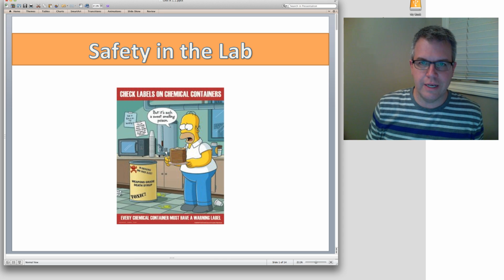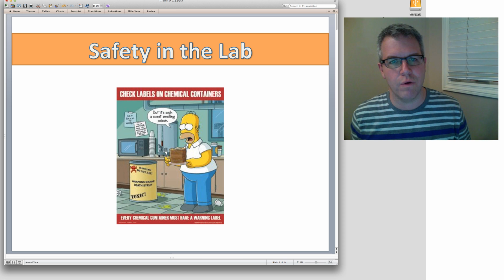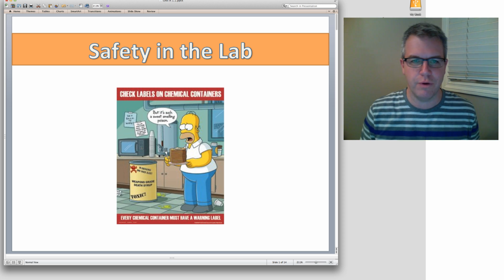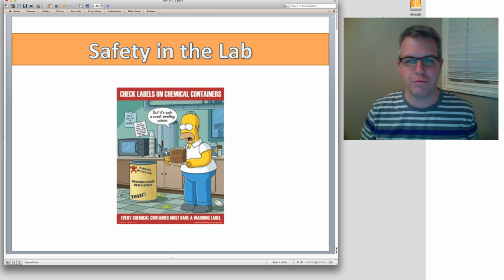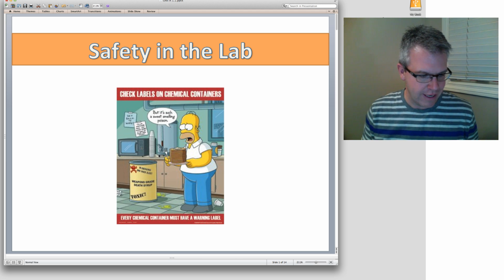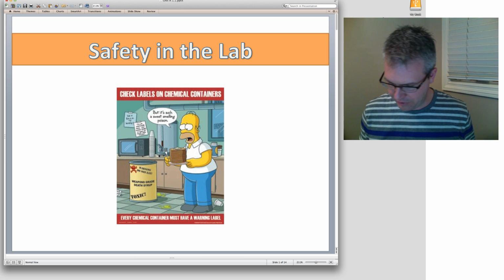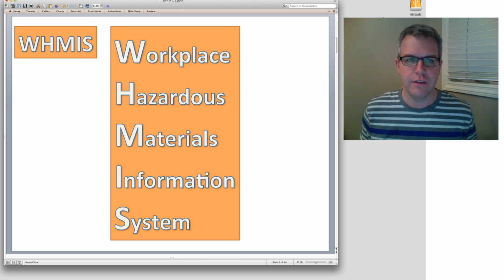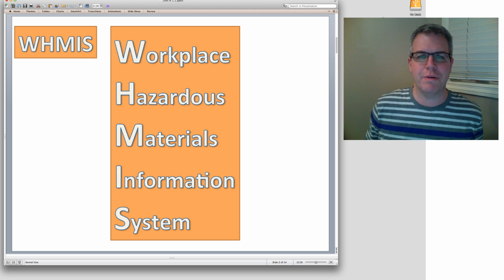So welcome to our Safety in the Lab video, and this is section A1.1 in your textbook. If you want to follow along, it's not going to follow along exactly with the way the textbook goes, but I will refer to a couple of pages, and it is set on pages 6 to 11 in your textbook. So safety in the lab, one of the first things we need to look at is what WHMIS means.